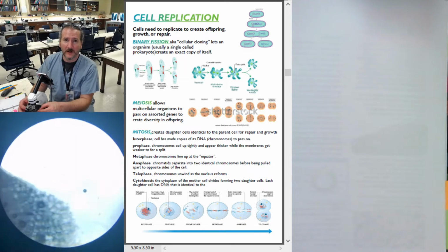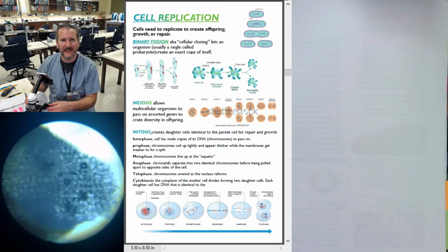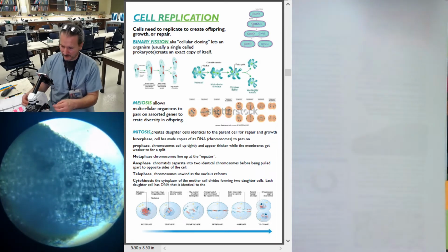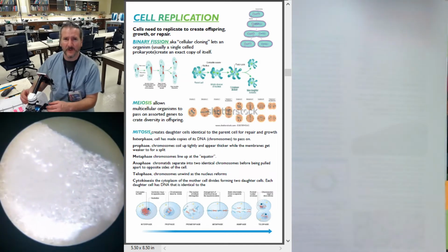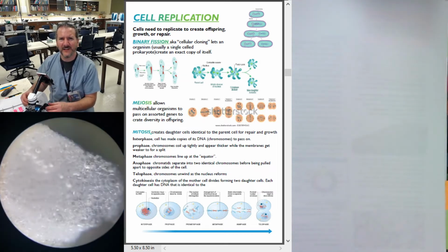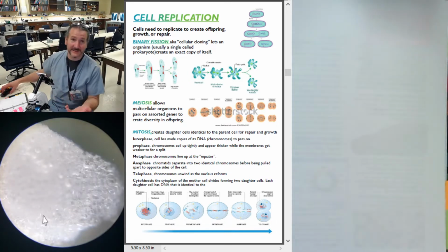I'm gonna go along. Oh wow. That one. That's pretty thin. That's pretty decent. Very cool. I'm going to snap a picture of that one. Like that, you can see some of these individual cells here. Boop. Hello, photo op. Right there. That looks pretty good.